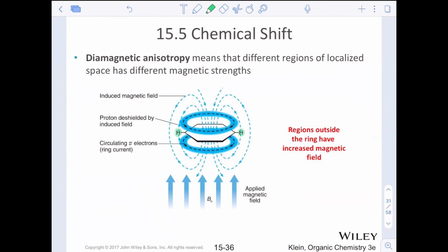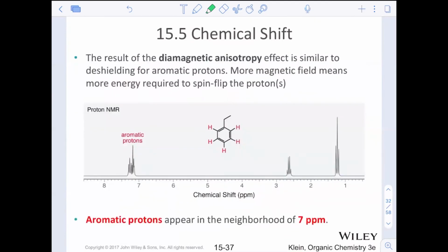What this does is it actually creates the aromatic protons. We'll talk about aromatic rings. Benzene is our biggest example for aromatic compounds at this point in our chemistry careers. They appear extremely downfield because of this effect. They are very de-shielded aromatic protons.